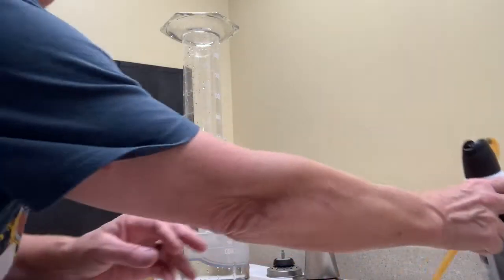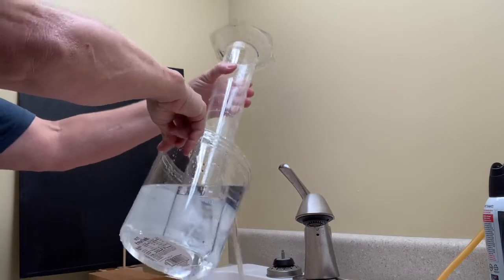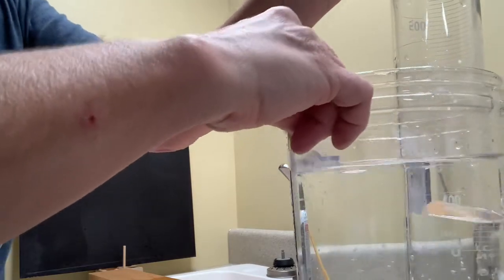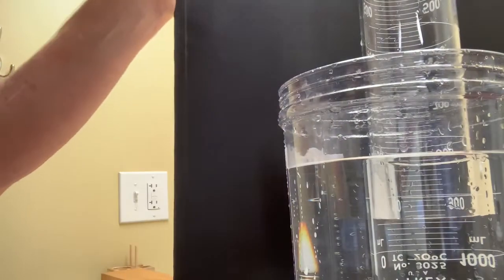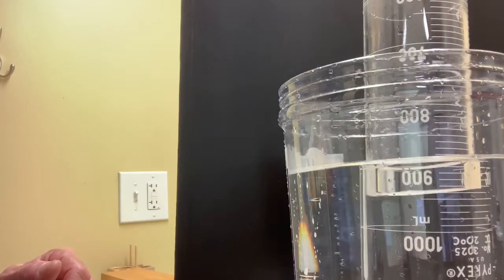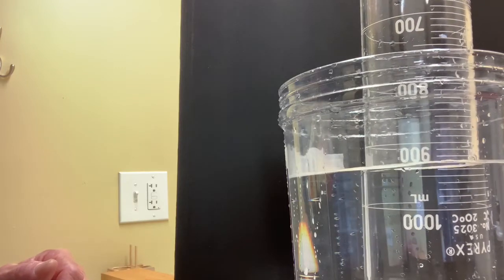Move the canister out of the way. Dump out some of the excess water so I can bring the apparatus closer to make a reading easier. Also put a dark background behind which may make it easier to see. So watch carefully and do the best you can to make a measurement of the gas in the grad cylinder.